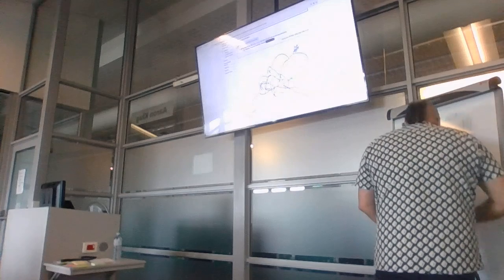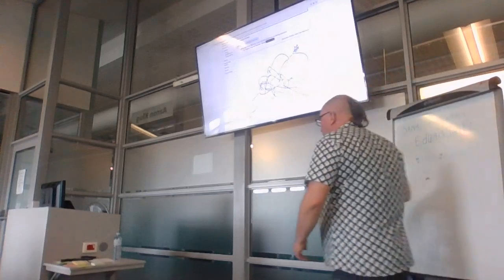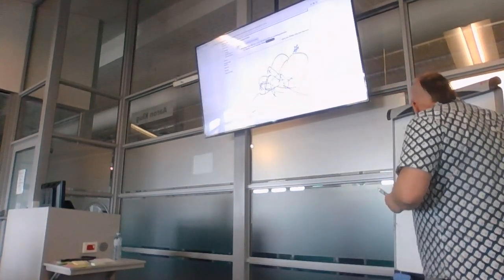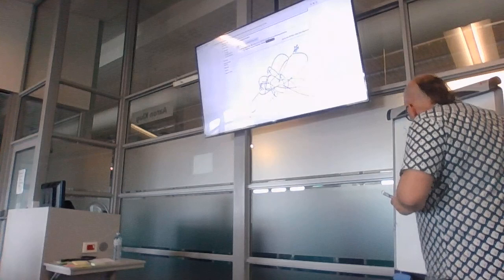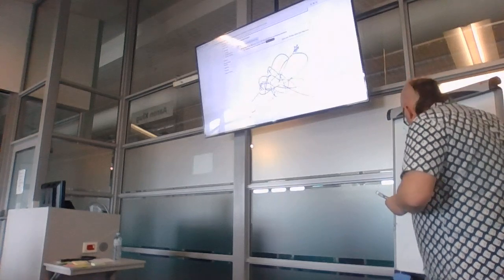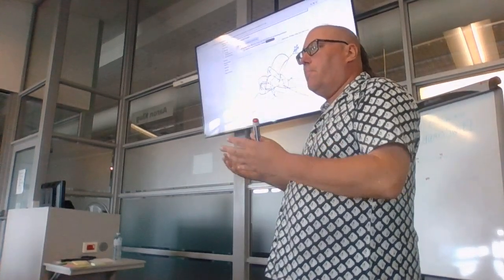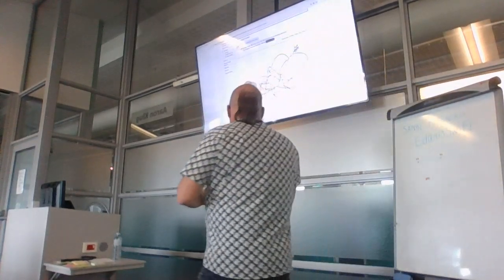We've got a chunk that's all unique, and then if we look at what this means in terms of the assembly graph, what we can see here is a piece of genome, and then it's either followed by this piece or it's followed by that piece. So that's why we end up with these weird splits in the assembly graph, because we're not able to resolve the repeats with short reads, because short reads are not long, they're not covering the whole repeat, okay?